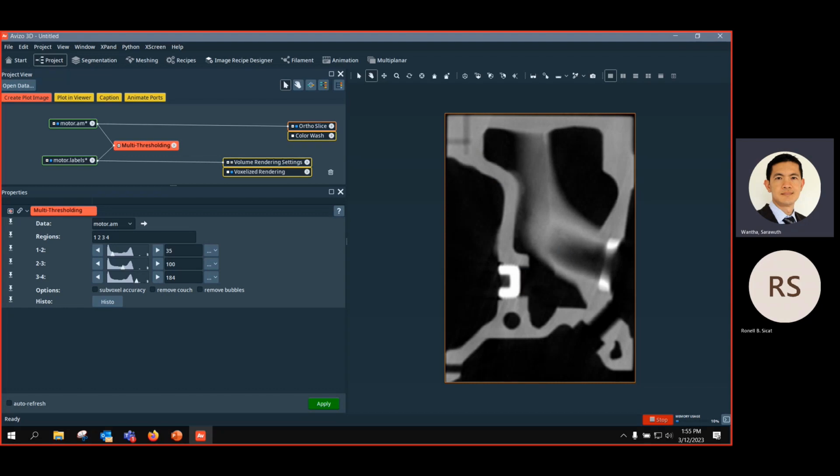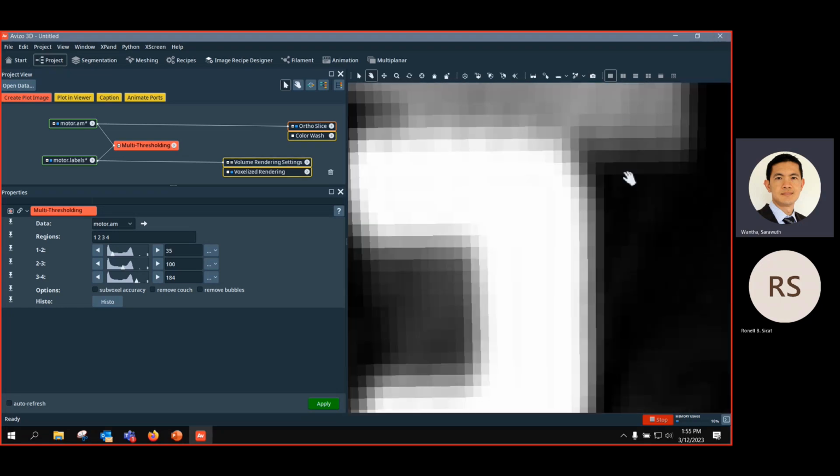That's two. Yeah, but you can also define it, if you know exactly, or you can do it like this and examine what the exact value is. So if you use this probe for content update, and again here, you can see that this value doesn't come up. And probe and click.